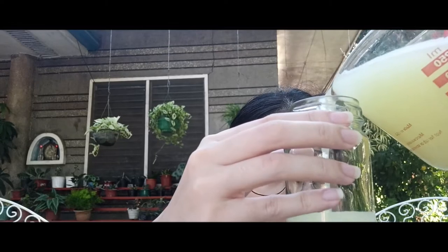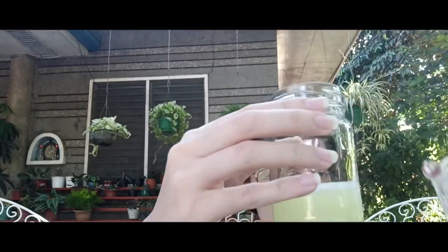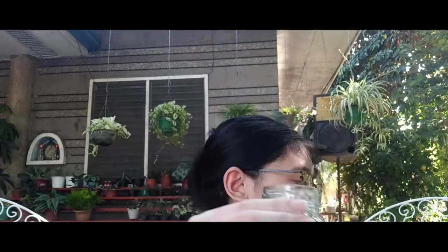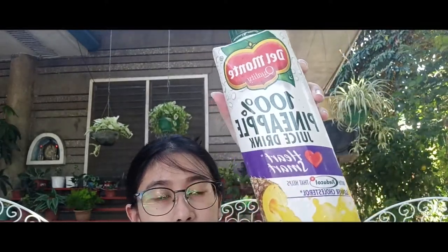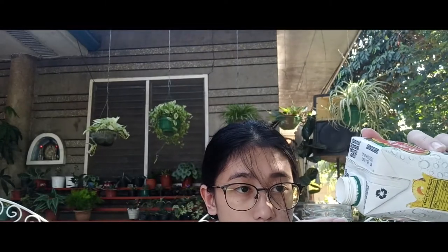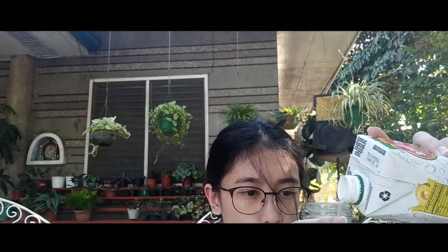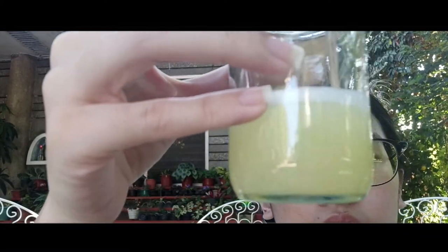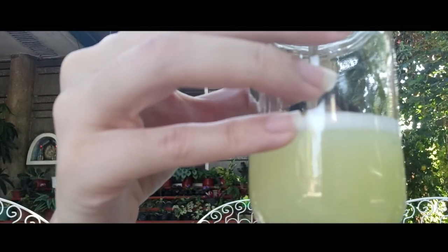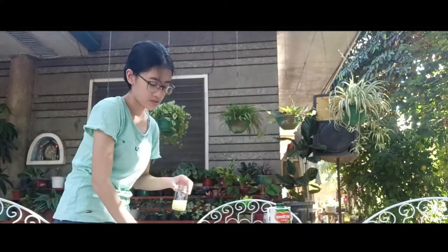Fill a test tube or small glass container to 1/3 with the cell soup. Then add a small amount of solution containing the proteolytic enzyme. This protease degrades the DNA-associated proteins and other cellular proteins to get a clean sample of DNA.